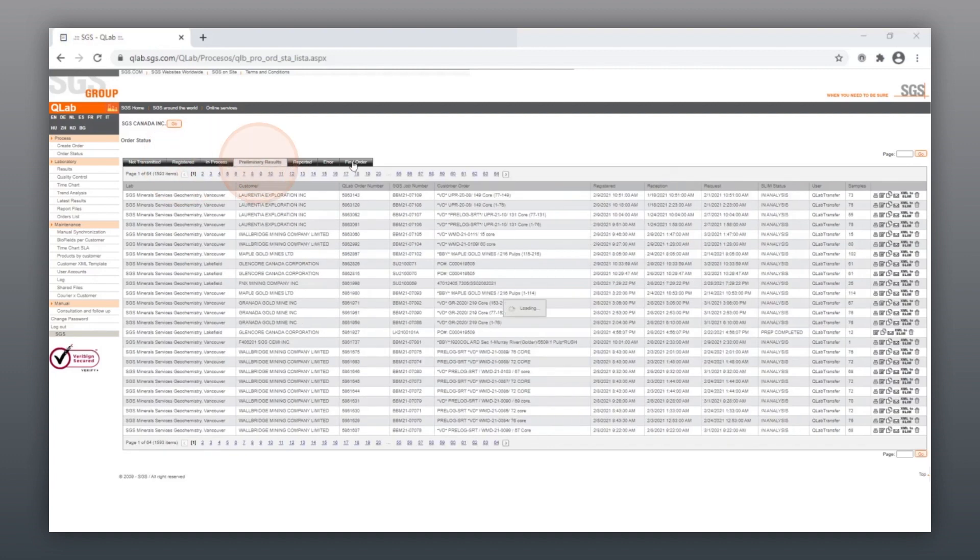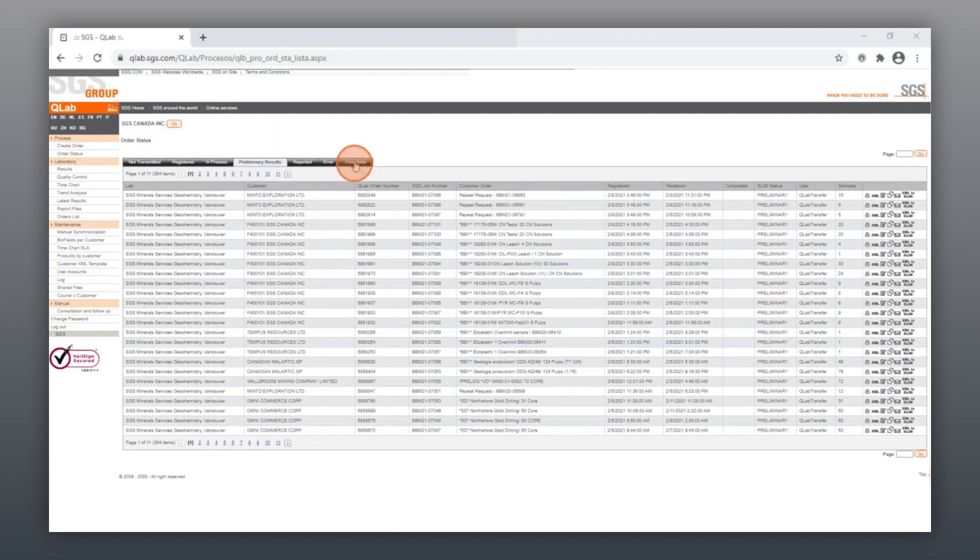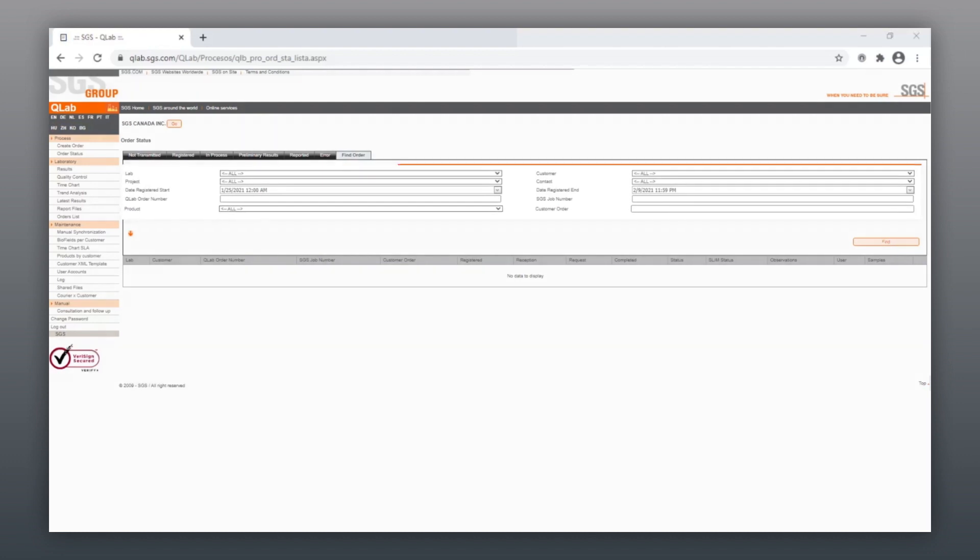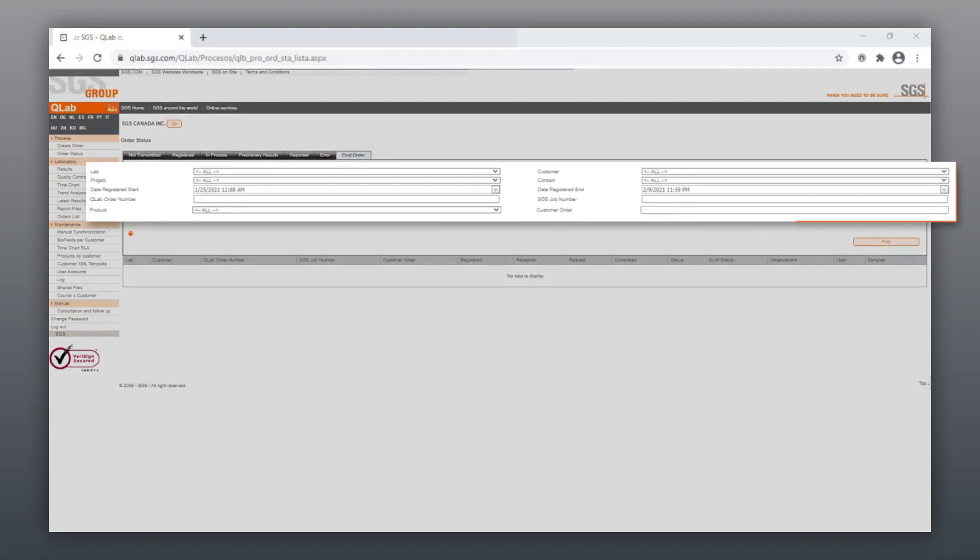Click on Find Order, and enter search criteria. Click on Find, then click on what you need.